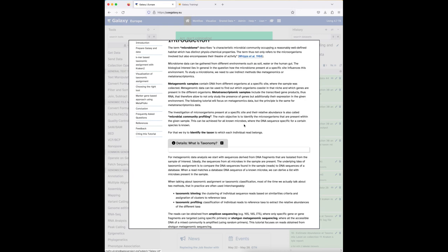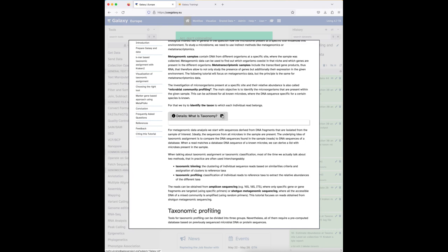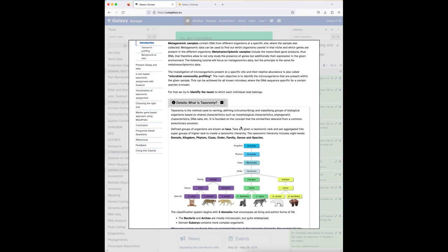When investigating which microorganisms are present at a specific site and their relative abundance, we create a microbiome community profile. The main objective is to identify the microorganisms present within a given sample and compare between different samples. Because we cannot usually identify each individual organism, we identify different taxa to which the sequenced DNA reads belong. Taxonomy is a method used for naming, defining, and classifying groups of biological organisms based on shared characteristics.